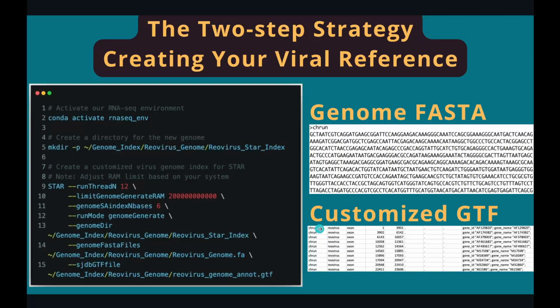Look at the first column, it is the name of the sequence. ChrUn means chromosome unknown. And the second one is species. For the third one, just make all exon. The fourth one and fifth one are the coordinates for the viral genes in the genome. You can leave the rest three blank. And the last one, the ninth one, is the name of the viral gene. So just make sure you have this correct format.